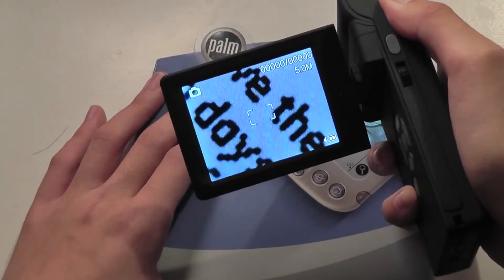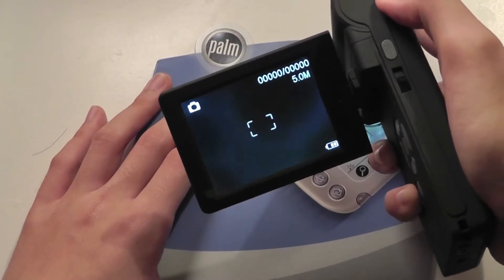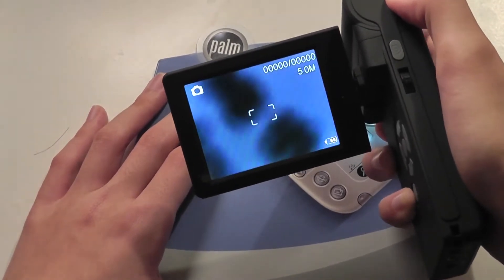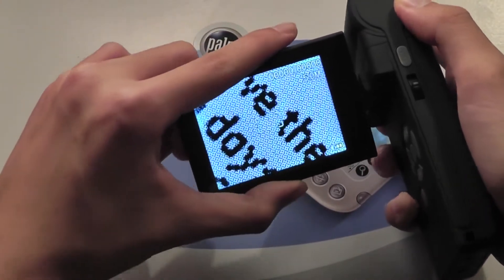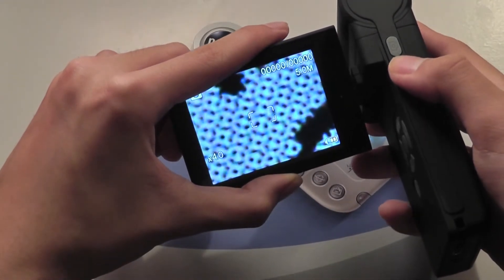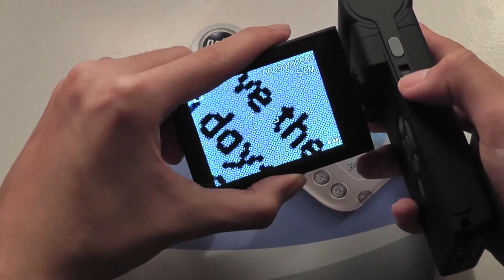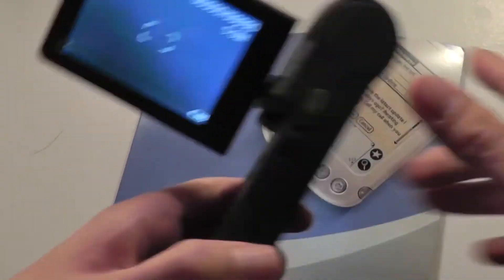I can even zoom in even more. You can actually get up to two stages of zoom-ins sometimes, depending on the subject that you're using. The paper here seems to be only a one-time zoom-in. I can also use the digital zoom to get even closer, to see the pores on the paper. Quite impressive.